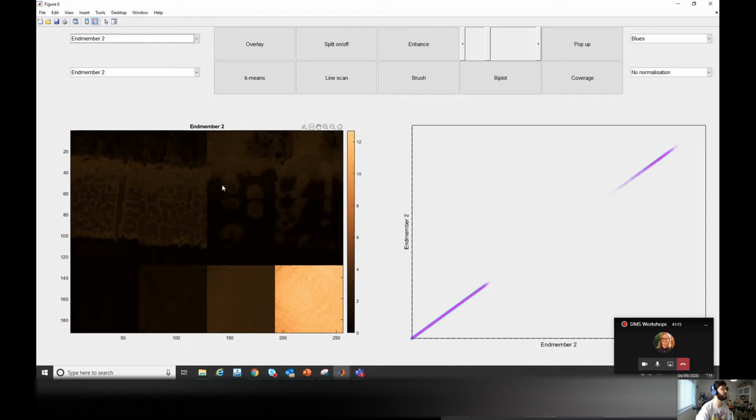This is interesting. You can see it shines really bright for the fourth reference, but it's not very strong for the others. It may be because there's not much there, but you can also try to renormalize it so that all the values add up to 100%. So you can here normalize by total. Yeah, it helps a bit, not much, or you can normalize by the maximum of the full map.